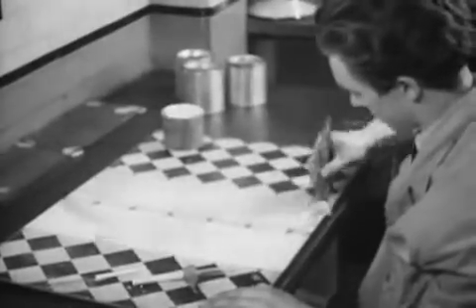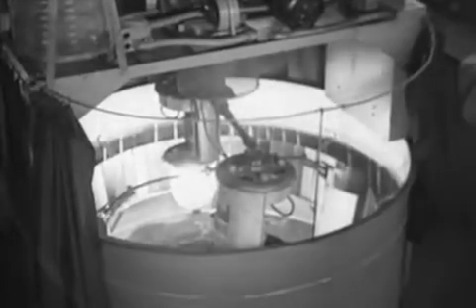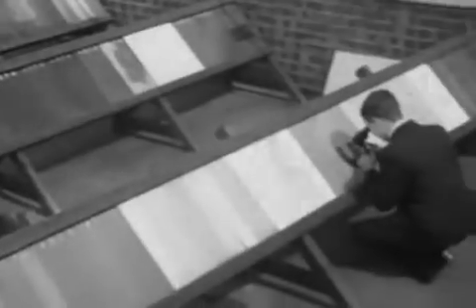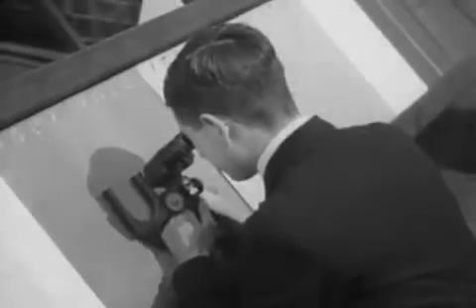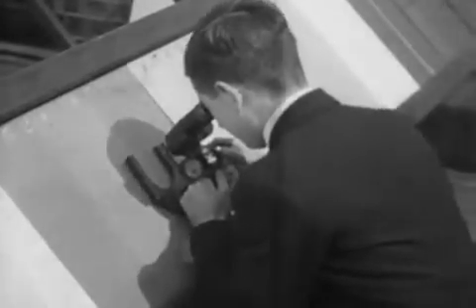Sample panels are made for testing by applying paint by means of spray or brush. Tests for covering power are carried out, and the sample panels are tested in the weatherometer, which subjects them to alternate arc light and water spray. Six weeks in this apparatus is equivalent to a year of ordinary weathering. Other paint samples undergo a long period of exposure to normal weather conditions. By regular observation, much valuable data is obtained on the wearing qualities of paint.